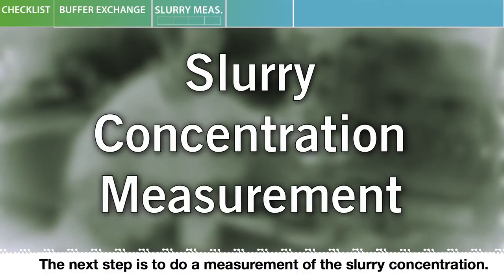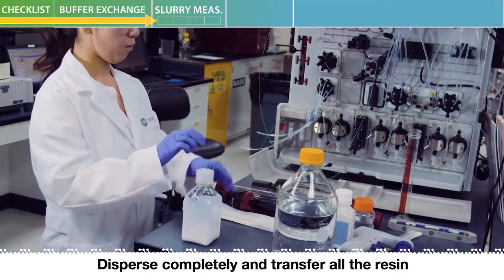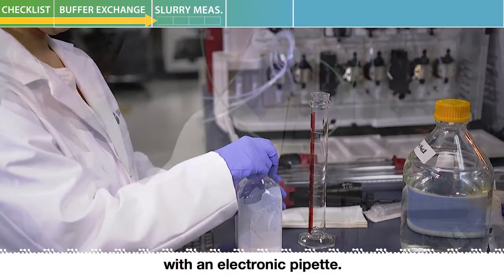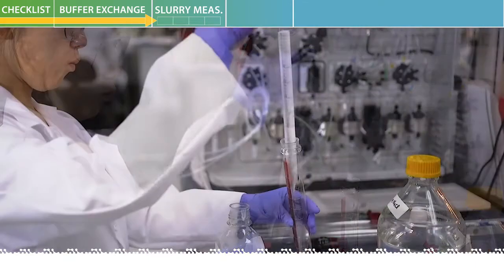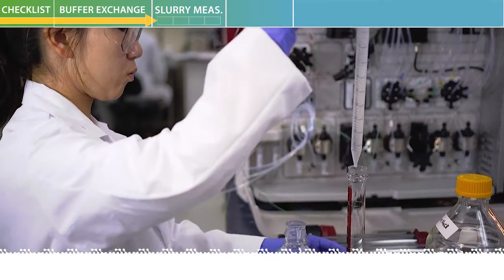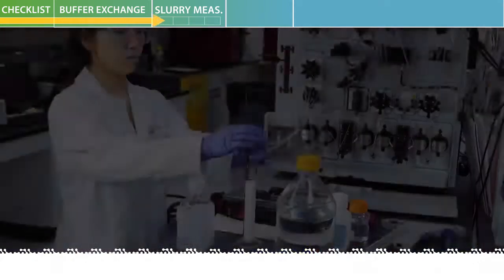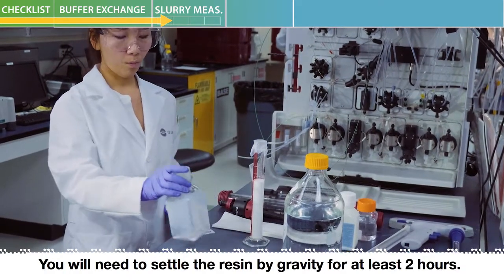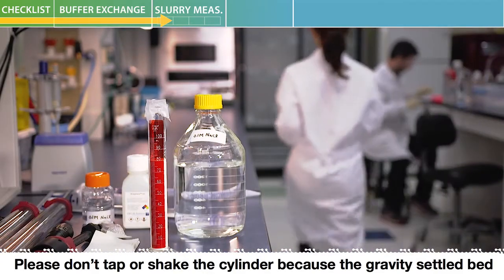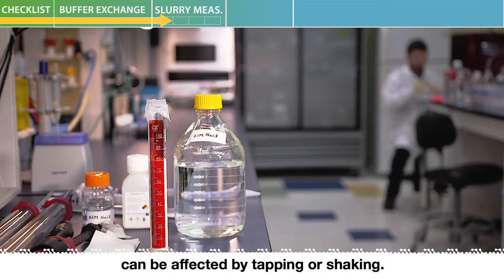The next step is to do a measurement of the slurry concentration. Disperse completely and transfer all the resin to a 100 milliliter graduated cylinder with an electronic pipette. You will need to settle the resin by gravity for at least two hours. Please don't tap or shake the cylinder because the gravity-settled bed of AMSphere A3 can be easily disturbed and its settled bed height can be affected by tapping or shaking.